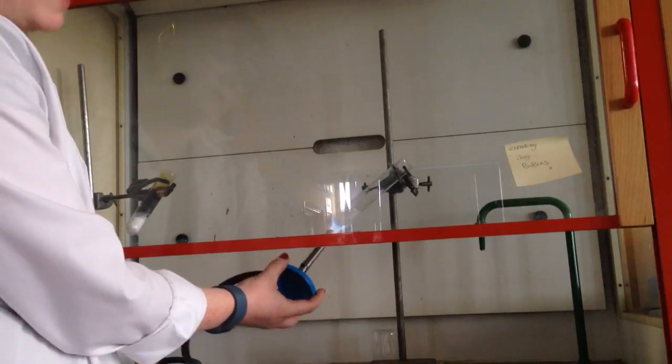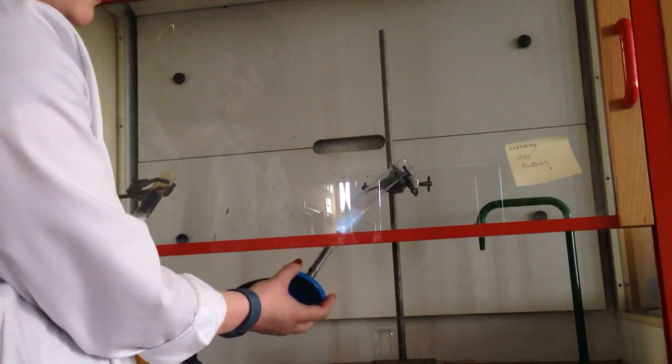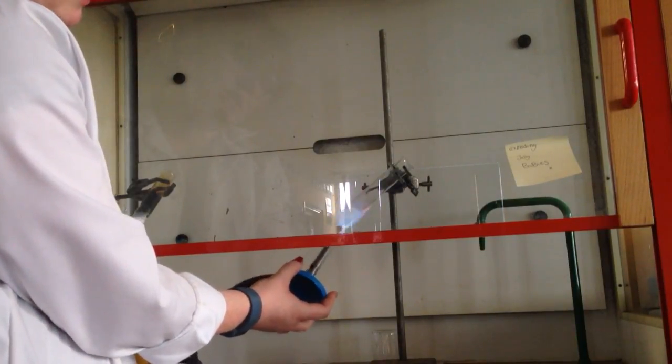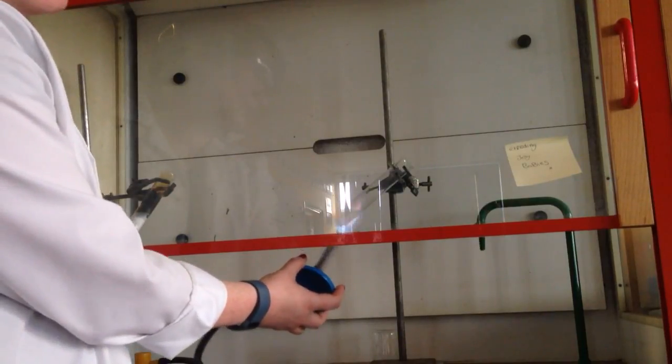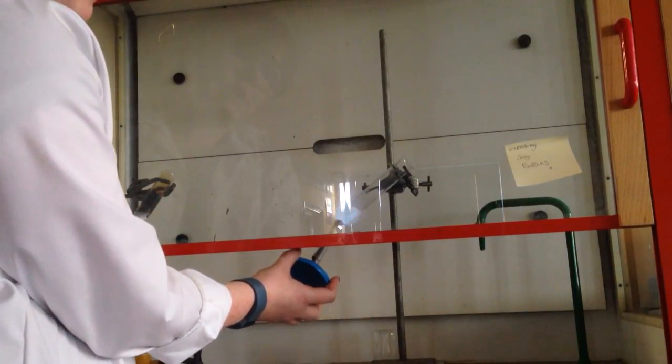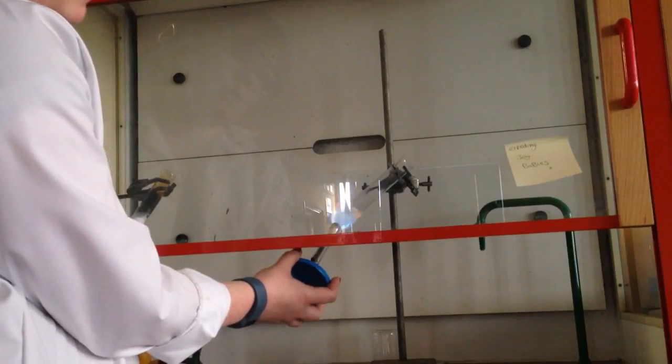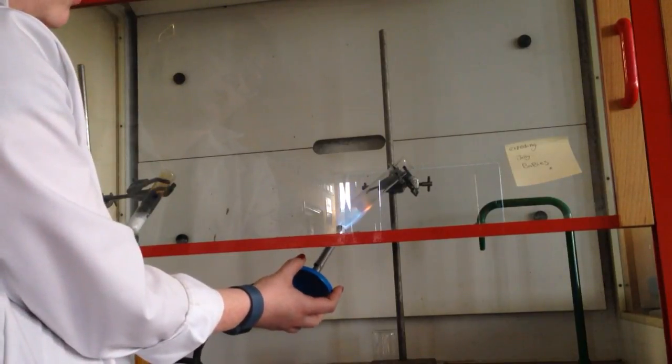So in the boiling tube here I have potassium chlorate which I'm heating. You need to get this liquid. I've been heating it for quite a long time but that was a bit boring so I didn't start the video then. You need to get this properly liquid for the experiment to work well.